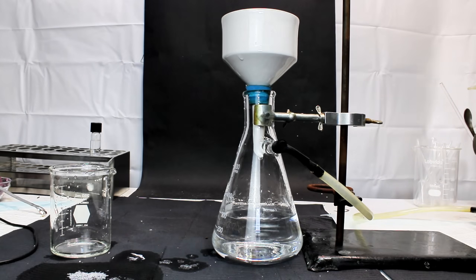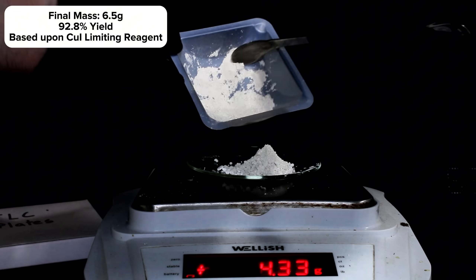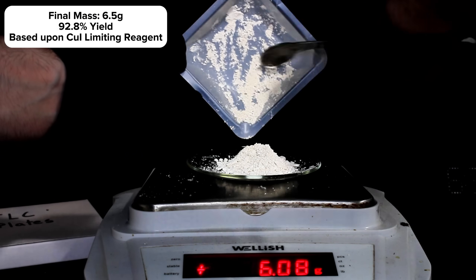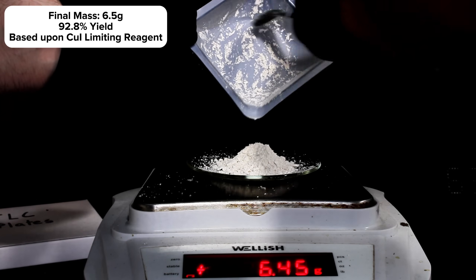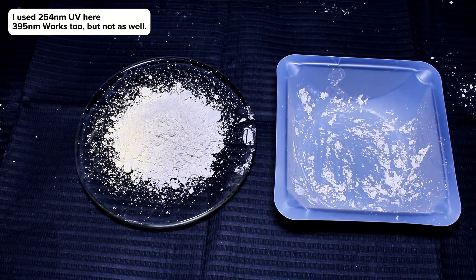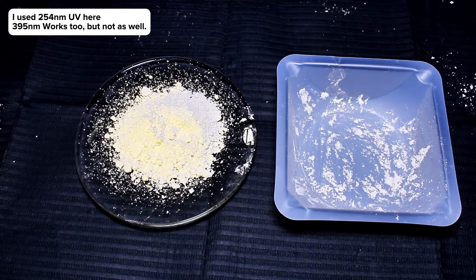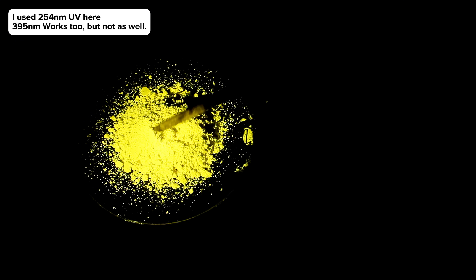My final mass was 6.5 grams, representing a 92.8% yield. Looking at the dry product, it is a very slightly off-white powder in normal lighting. However, under UV light, the compound exhibits extremely strong bright yellow fluorescence. This yellow is so intense that it is still highly visible when the main lights are turned back on, which is pretty unique for fluorescent compounds.